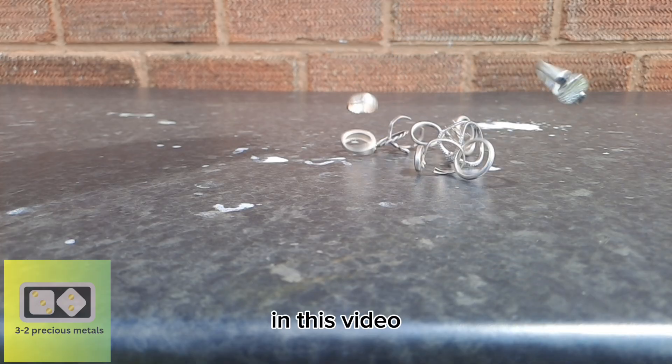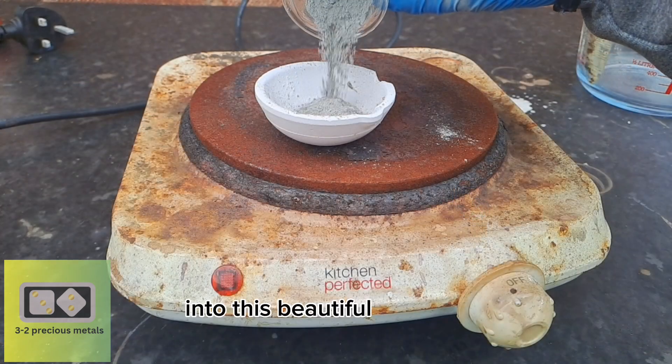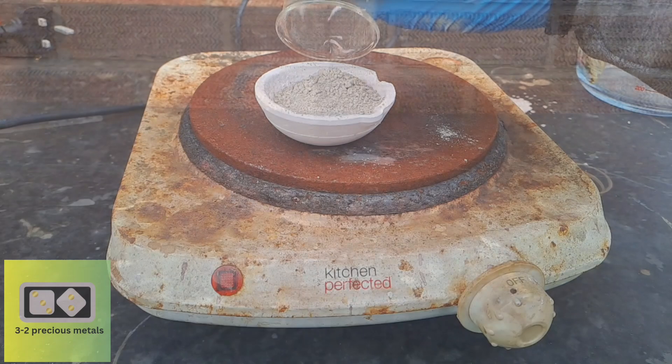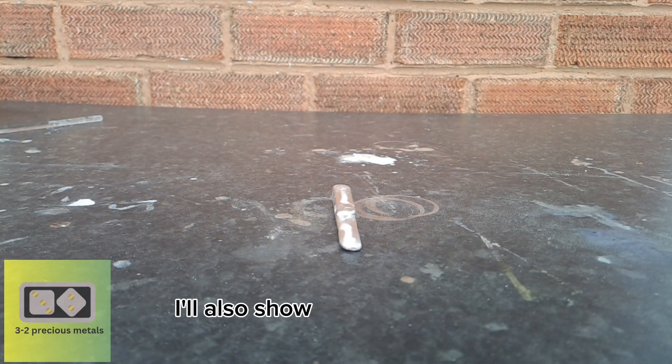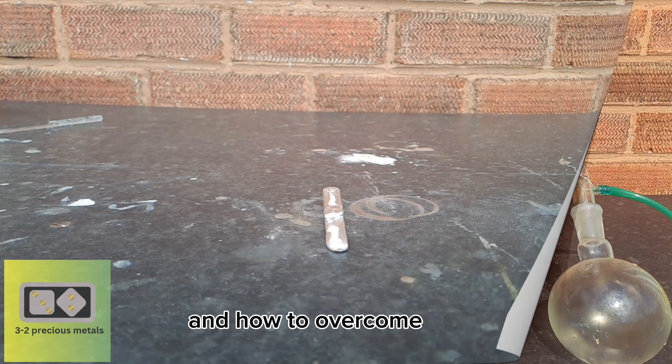In this video, I'm going to show you how I turned this scrap silver jewelry into this beautiful 99% pure silver cement powder, and melted it into this shiny silver bar. I'll also show you some of the problems people face when dissolving silver in homemade nitric acid and how to overcome them.